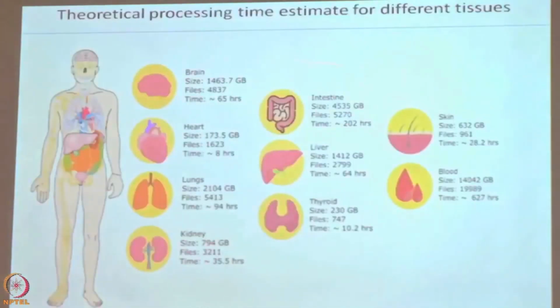As you can see, it took about several months for us to analyze tissue by tissue where the proteoforms are, and after doing the analysis we realized, oh, this is not the human tissue I was looking for, it is just a cell line. So, a lot of back and forth we had to do. We learned a lot of lessons while doing all these things, that it is not that straightforward.